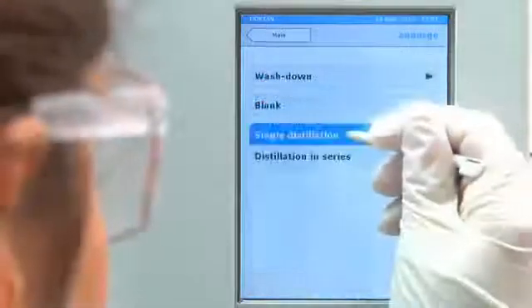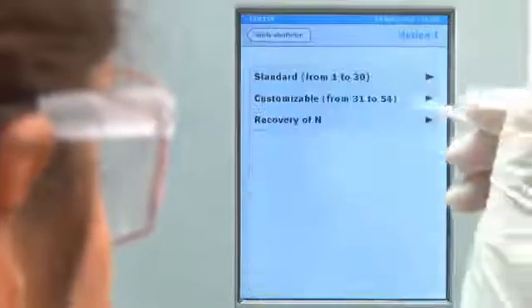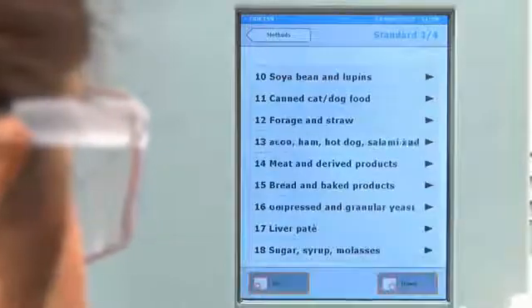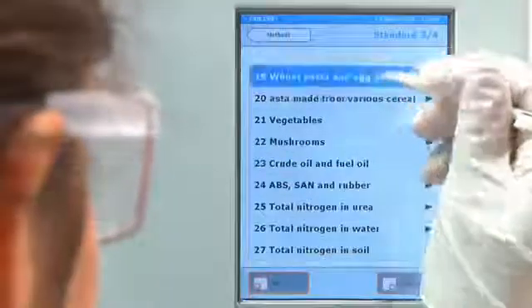A 54-program library covers the needs of any laboratory. The multitasking software enables all the parameters to be set for fully automatic control of the distillation and titration processes.